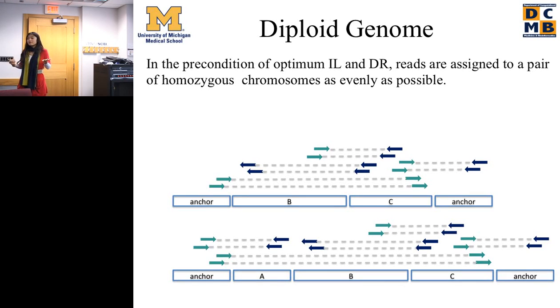If you have a very messy region, not all the blocks in the region are necessarily linked together. Maybe there are some local parts where all these rearrangements happen within one block. Then you can solve this block first, and then expand to a larger region. You can just solve this local region, fix it as the best structure you think is there, and then continue adding additional breakpoints and try to solve it at a larger scale. Okay. But of course, with these technologies, you are limited by the technology and by the reference.